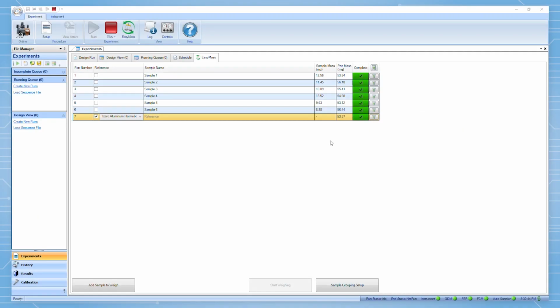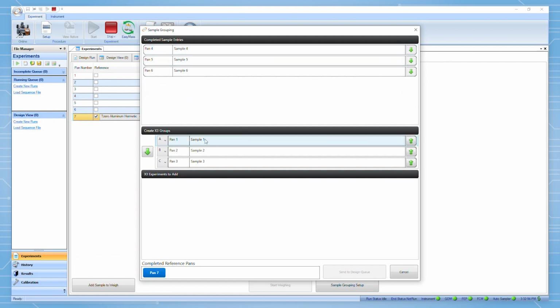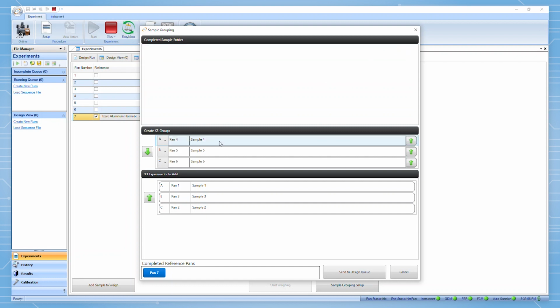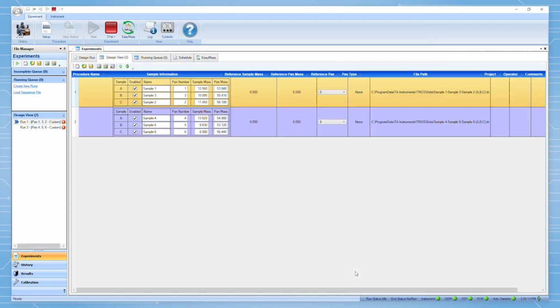With the Discovery X3, there's just one additional step after weighing. Before sending to Design View, you will create groups of up to 3 samples for each run. A dialog will appear, and any completed sample entries will be listed. Click the arrow to group up to 3 samples together into one X3 run. Edit the sensor positions if desired. Then add that group to a run entry. Keep making these groups of 3 until you are finished with your list, then send these experiments to the Design View. You are now ready to finish setting up the experiments like normal.